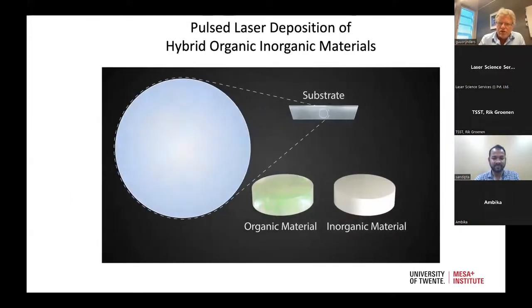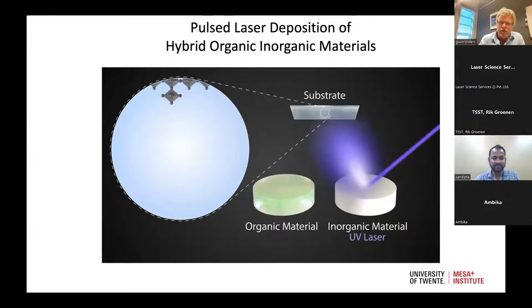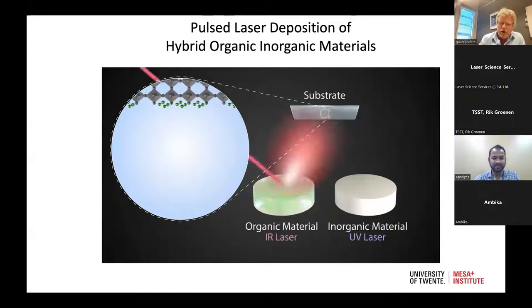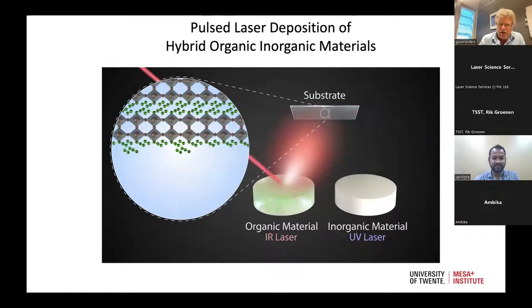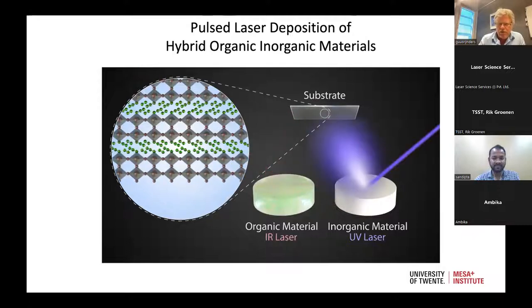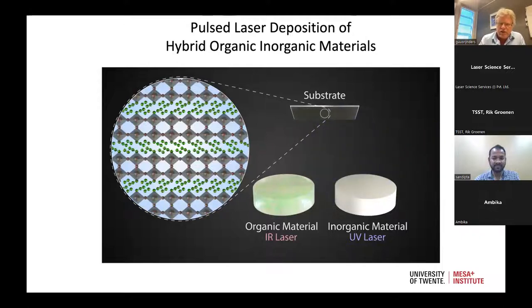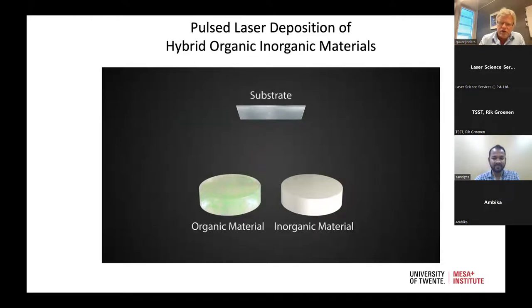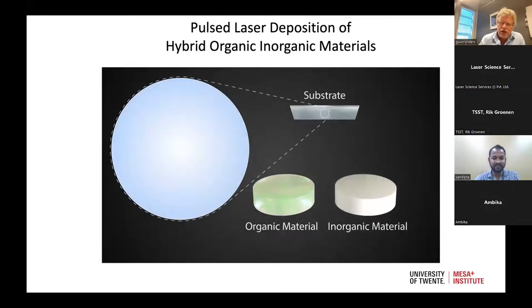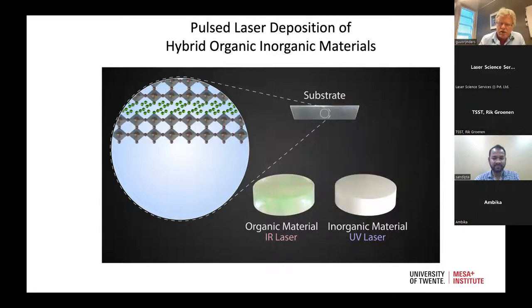Another interesting thing is that we also work on hybrid organic-inorganic materials, where the idea is to use different lasers and different materials. Such a movie was already shown by Rik, but now you can imagine that you use different materials and different lasers to have layer by layer fabrication of organic-inorganic thin films. And this relates to one of the questions that I saw in the chat on ablation of very soft materials like polymeric substrates, etc.